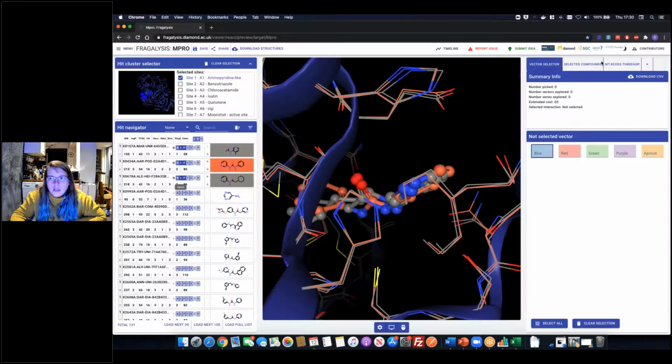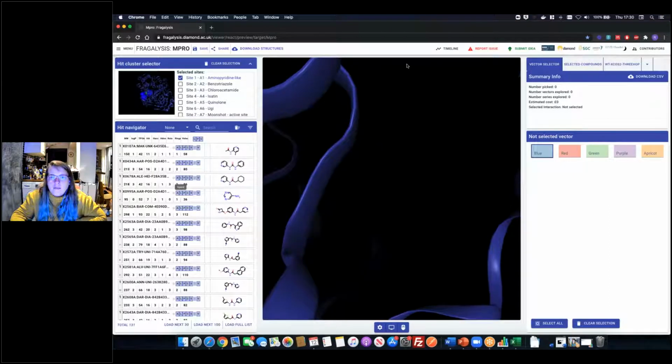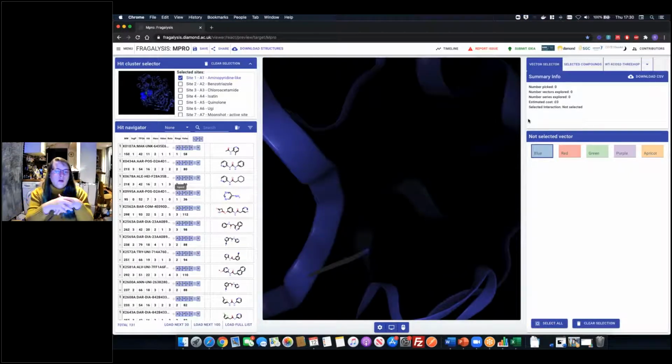Okay, so we can close that. So the final bit that I've mentioned and would like to talk through, I'll just clear all this, is the idea of uploading new designs. A lot of the time, I think there'll be people in the audience that are familiar with this and maybe others that aren't. And we've touched on it briefly already.